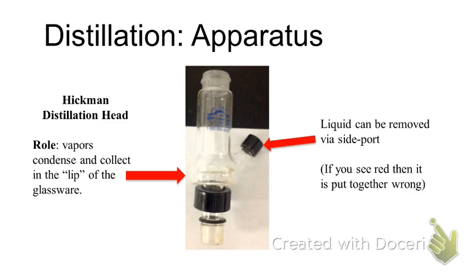This thing is built to get your vapors up away from the heat. Well, if it's up away from the heat, what happens? Very simple observation. It condenses, which is the harder observation. It cools. There's no heat. Well, if there's no heat, our vapor becomes a liquid, condenses, drips back down, and there's a little bulb at the bottom of this, okay, where your liquid will collect. You can then unscrew the side cap and pipette the liquid out that side, okay, as your reaction's going.